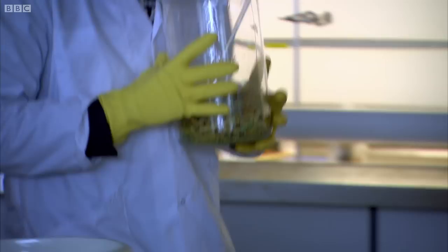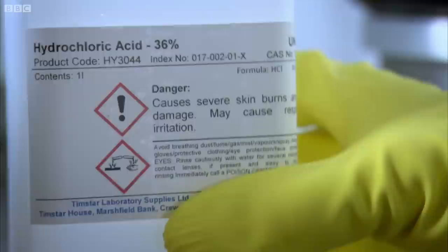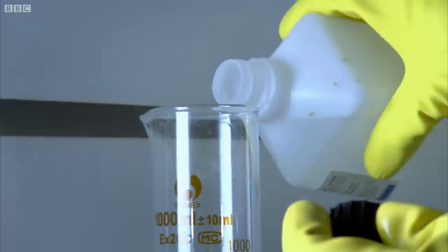But it still leaves us with the problem of separating the gold from all the undissolvable rubbish that's in circuit boards, which means, unfortunately, we're now going to have to dissolve the gold. It sounds like a gamble, but I'm hoping it'll pay off in the end. Because gold is so unreactive, I'm going to need some really powerful acid to dissolve it.